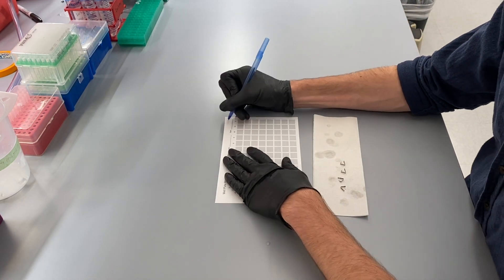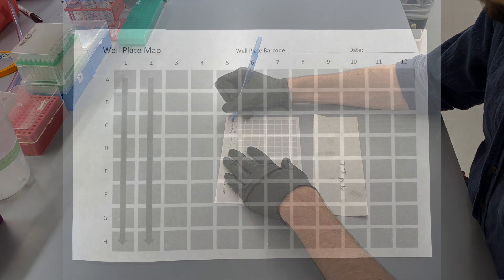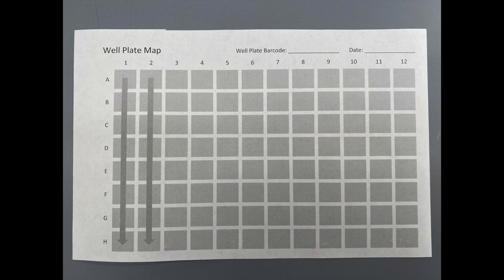Here you can see that I've got the organization sheet. This matches the Transnetyx sequencing plates and is used in order to help clarify exactly what's going on when I am organizing the plates. You can see that there is a place for the plate number for Transnetyx genotyping, as well as the date. I always put the strain at the top of the sheet as well, to make sure that there's no confusion as to which type of mouse this is.